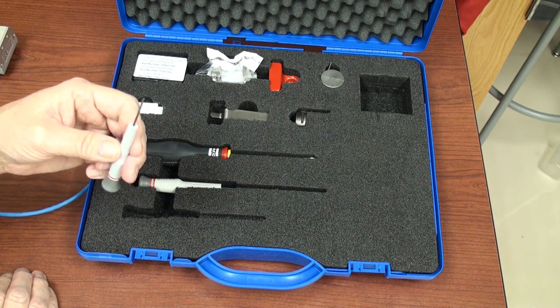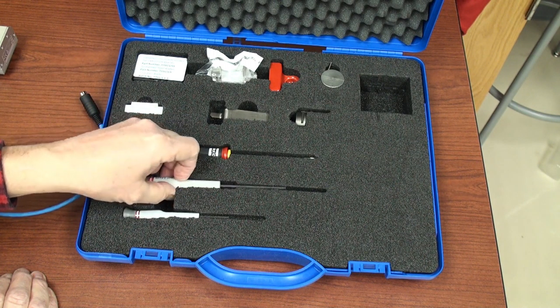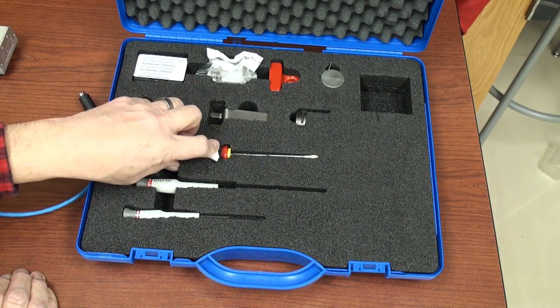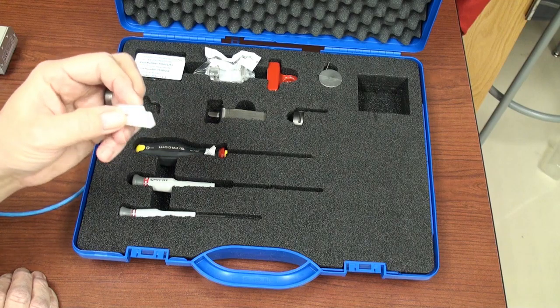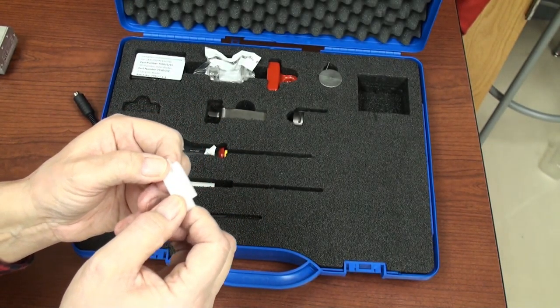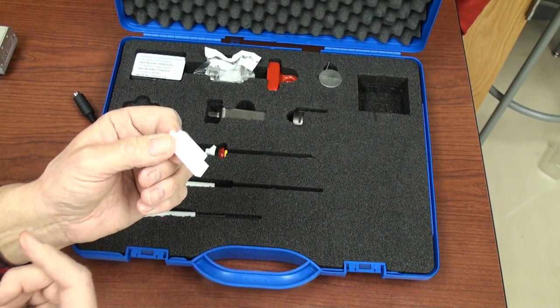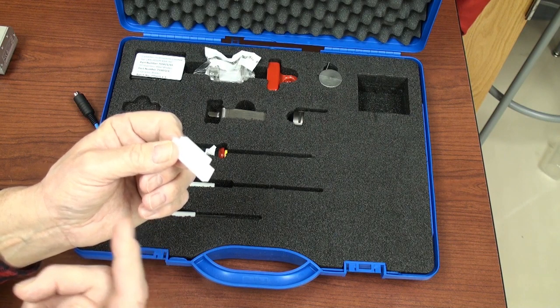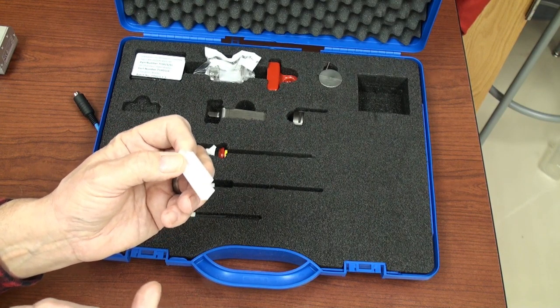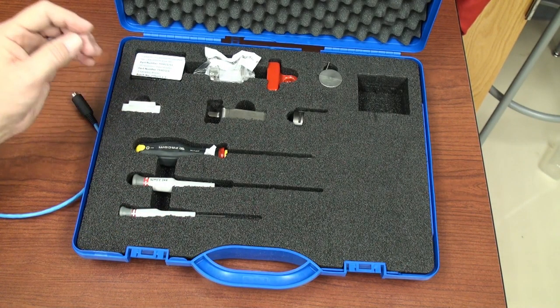Here we have various tools used in setting up the instrument: some hex drivers, a Phillips head screwdriver. This is a safety device which you can insert the blade into, and then use the whole holder to install or remove the blade safely from the knife holding mechanism. It's a safety device so you don't cut yourself — a very important item.